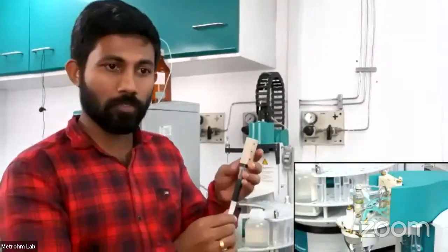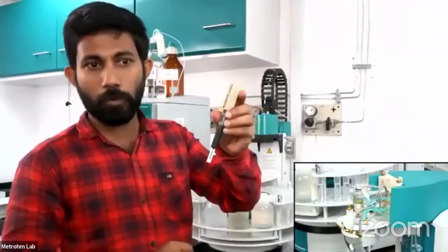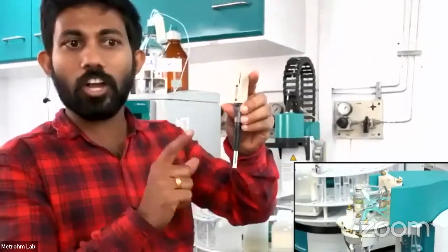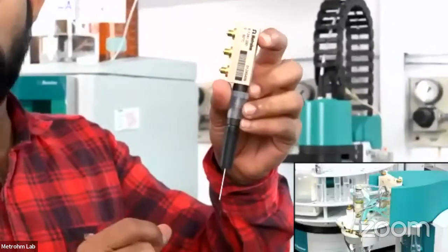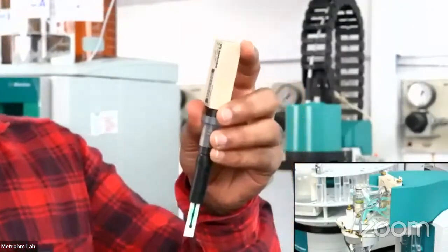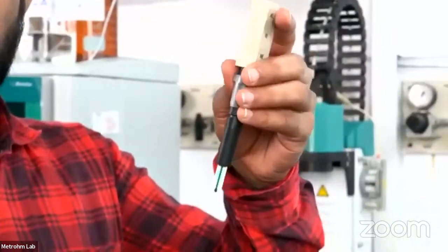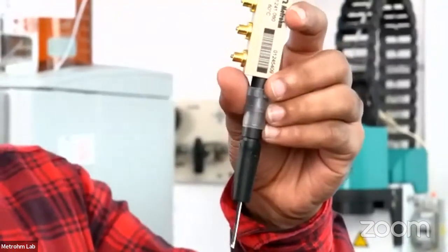And in addition to this, we have one more electrode system which is recently introduced, as Nilesh sir already explained prior. We have an electrode system called screen printed electrodes. It's a combination of all three, meaning working, reference and auxiliary. All three are present in a single system itself. And this is mainly used for the analysis of arsenic and mercury. Even PPB or PPT level of mercury and arsenic can be determined by using this single electrode itself. It's a highly sensitive electrode system.